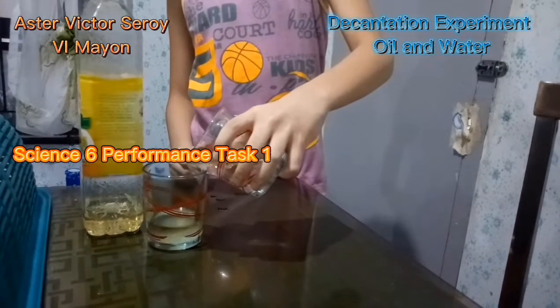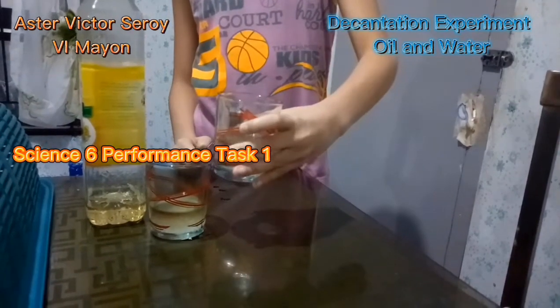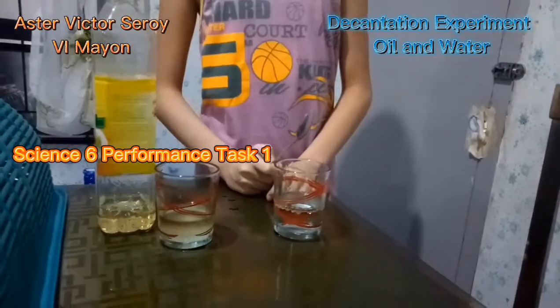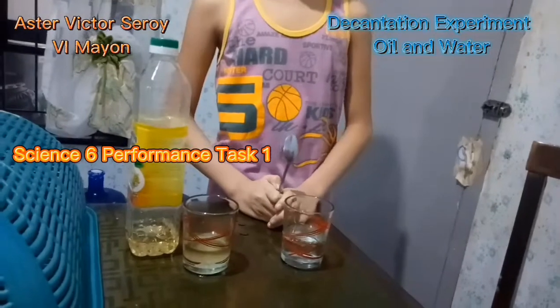Now we're going to perform the Decantation Method. And now we separate them using the decantation method.